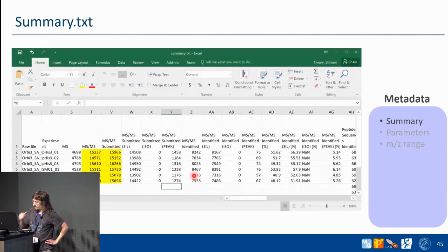And yes, as I said, this was a kind of easy, quite relaxed topic to start. There is nothing fancy, nothing really to understand, just names and stuff. So now you know more or less what you have in the output tables.